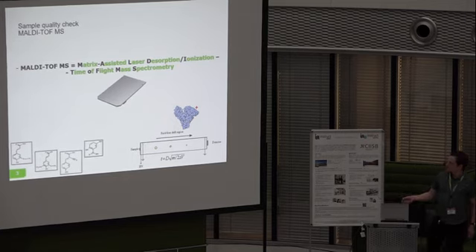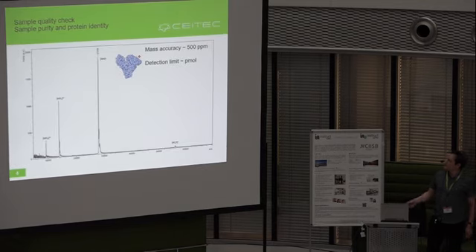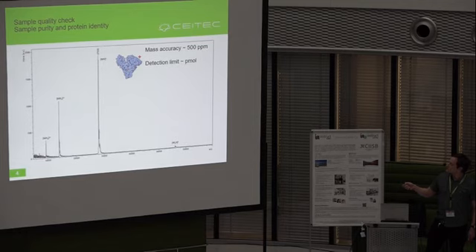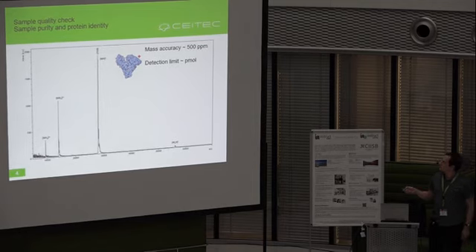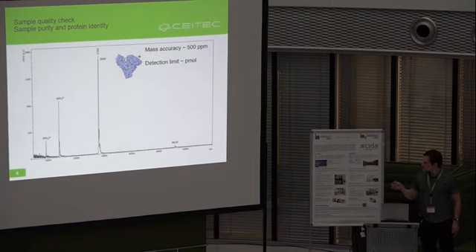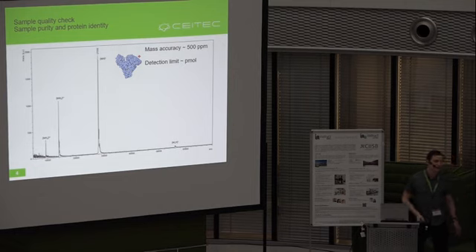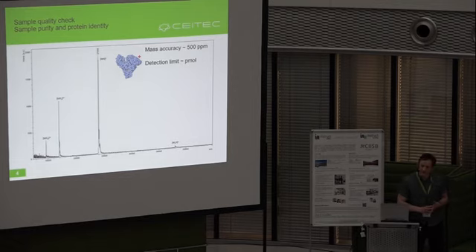A result of this analysis is a mass spectrum, where in the case that we had a pure protein, we obtain a simple mass spectrum where all signals can be assigned to different ionization forms of your molecule. The mass accuracy of TOF analyzers for larger proteins is about 500 ppm. The detection limit is quite nice. So whenever you obtain this peak after a single sample preparation, which takes some 2 minutes, if the mass matches your protein, there is high probability that it is really your protein, because I think it would be really a shame if you purified a different protein of the same mass.